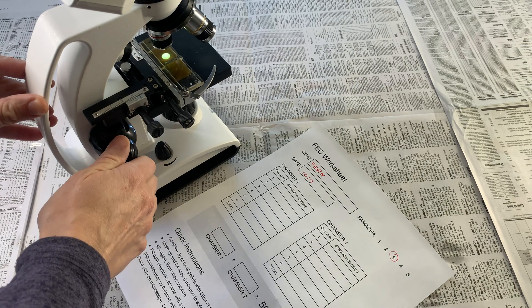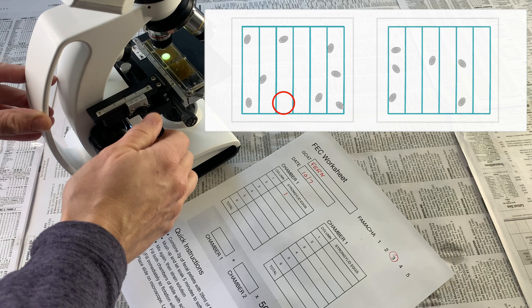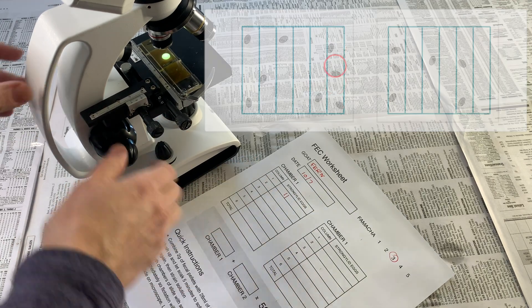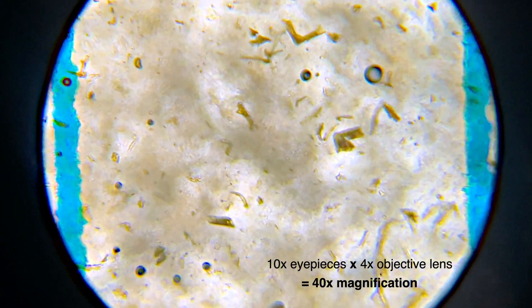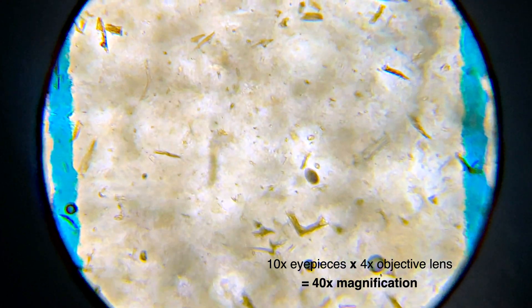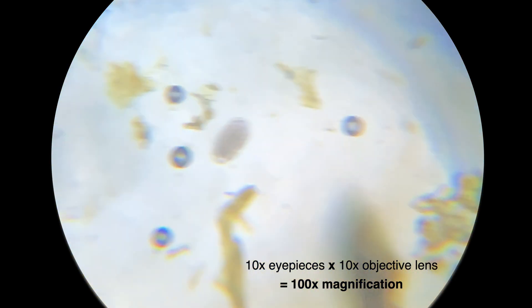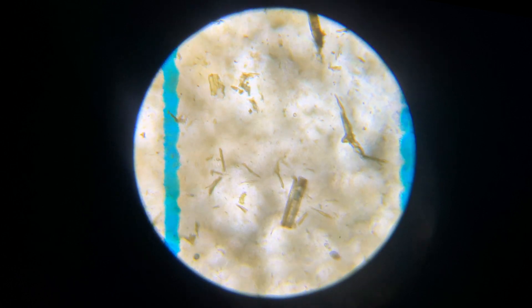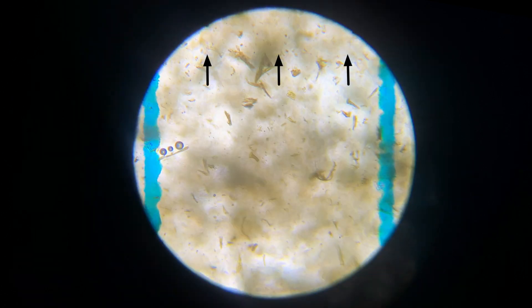Now that you're practiced in identifying strongylids, you can count them. Do your count by scanning through each column of each chamber, tallying the eggs on your worksheet as you go. If you use the 4x objective lens when counting, you'll be able to see the full width of each column, but the eggs will be small, so only do this once you're comfortable identifying them. Until then, you can use the 10x objective for a more detailed view — you'll just have to move the stage around more to scan the full width of each column. One issue to note is that with some microscopes and McMaster slides, you may be unable to move the stage far enough to see the very top of the columns, though this isn't a huge deal as it's just a very small portion of the slide.